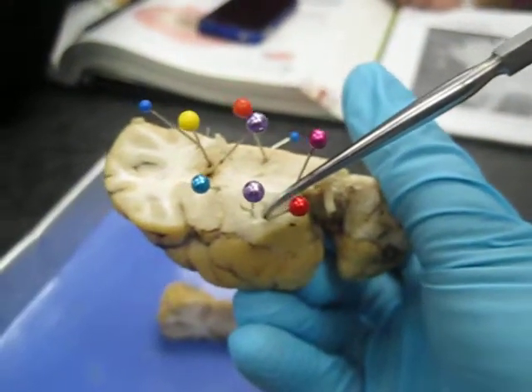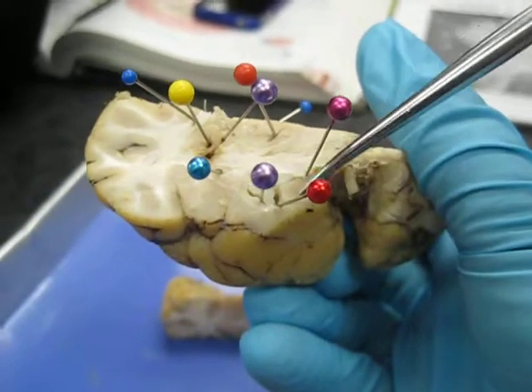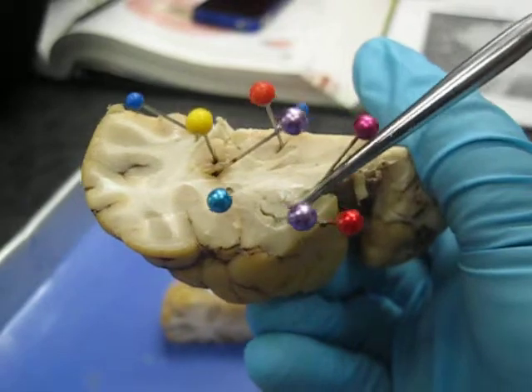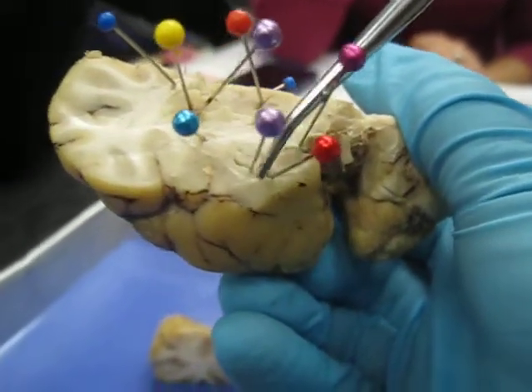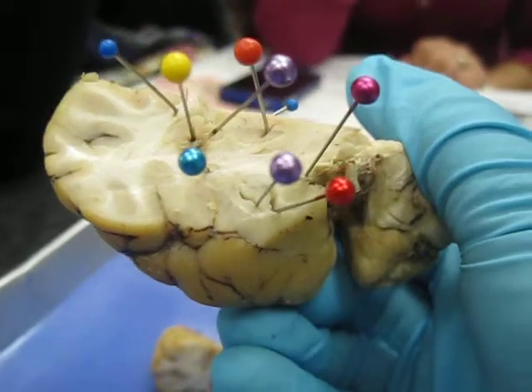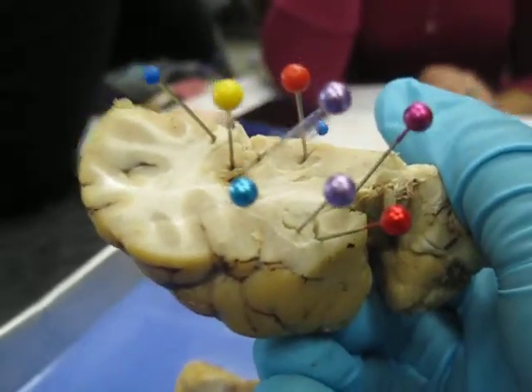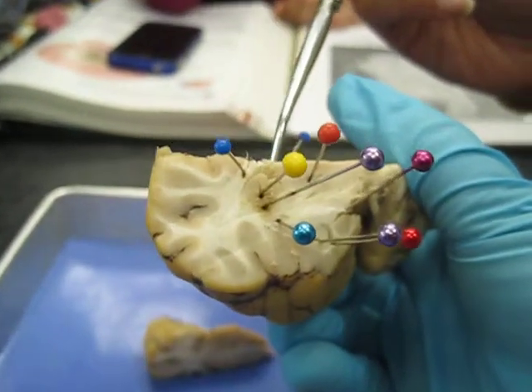And then next to the lateral ventricle, what horn was this again? Do you guys remember? Temporal. This is the frontal horn of the lateral ventricle, and this is the temporal horn. So next to the temporal horn, you have some gray stuff around it too. Do you guys know what that is? Look at it right here. Number 9. Amygdaloid body. Yeah, that's what that is. And that's it.